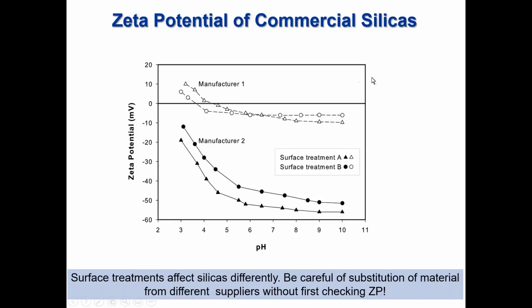And here's an example of two sets of data from two different manufacturers, supposedly equivalent, one in the US, one in the EU. Each pair has been subjected to two different surface heat treatments, and the zeta potential, as we see, can easily differentiate between them. However, it is quite clear that the two treatments cannot be the same. The materials from manufacturer one are clearly less hydrophilic, and there's very little difference in the zeta potential, but there's a massive shift in the isoelectric point.